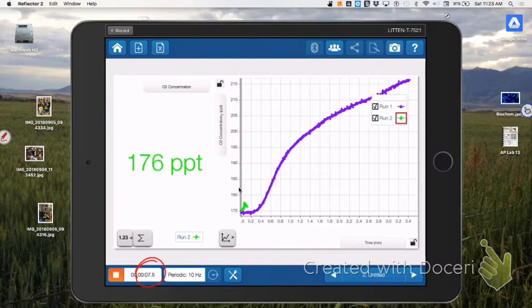Be careful that you don't press too hard when you insert the top, because a lot of oxygen will build up within the container, and then you don't want it to pop off and then you don't have any readings at all. So just be aware of that. Here I can see my trend line again with my 3%, to see if it's going about the same initially and if there are any changes.